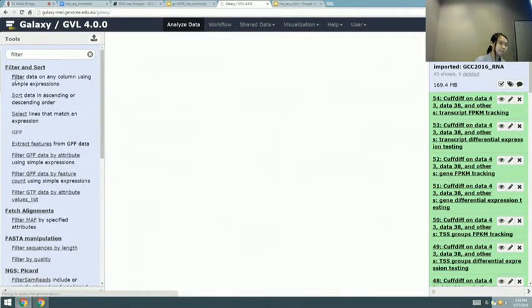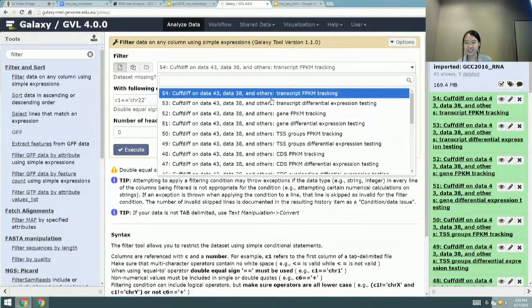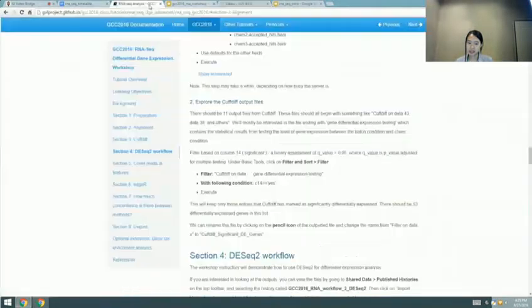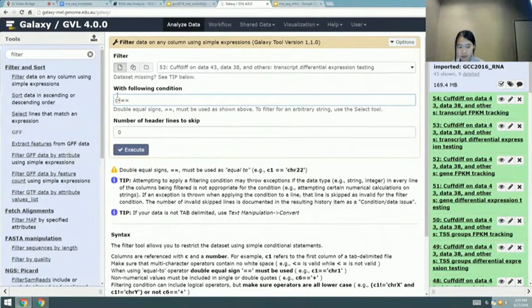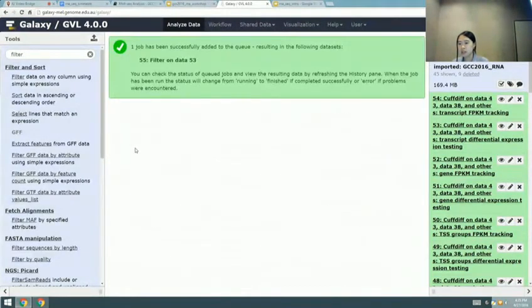How can you increase the number of significant genes? Do more replicates. Yeah, more replicates, more data. More biological replicates will give you more statistical power to detect differential expression. But you can't get more if the organism didn't behave differently, there's nothing you can do about that. No, but I think increasing the number of replicates will increase the power. People do 3, but that's actually pretty insane. Ideally, you would do 20.